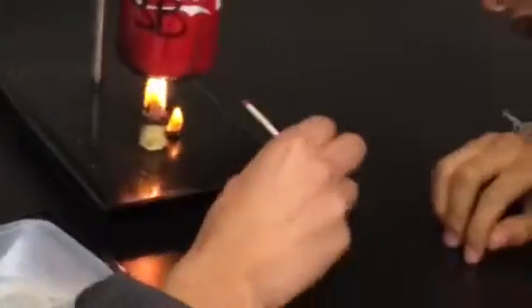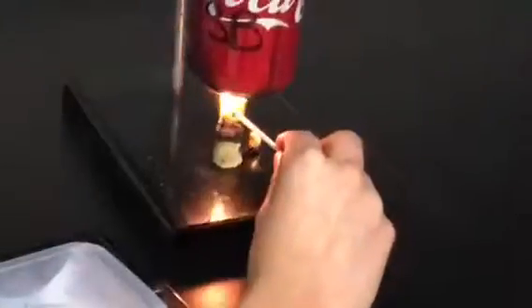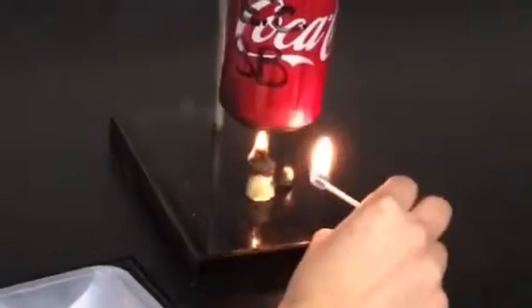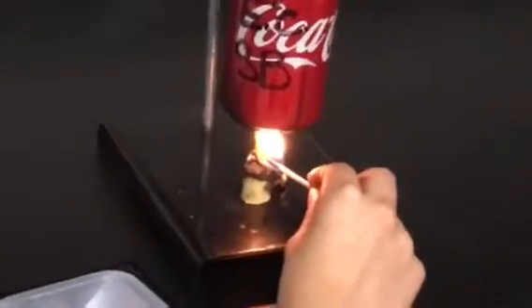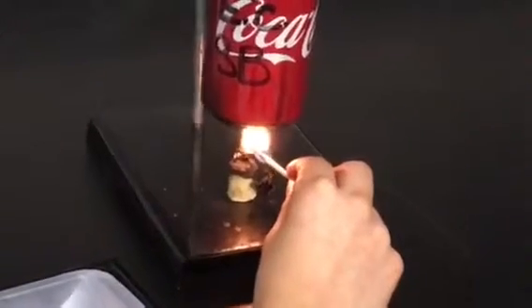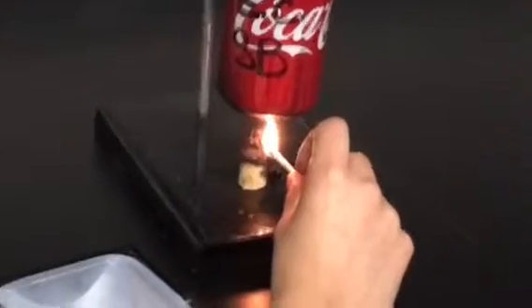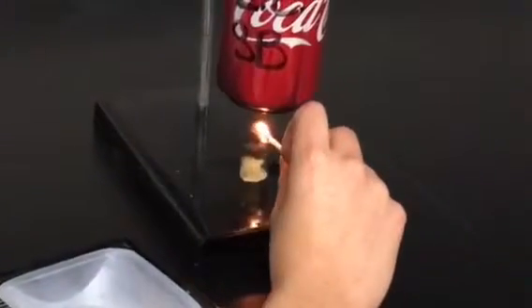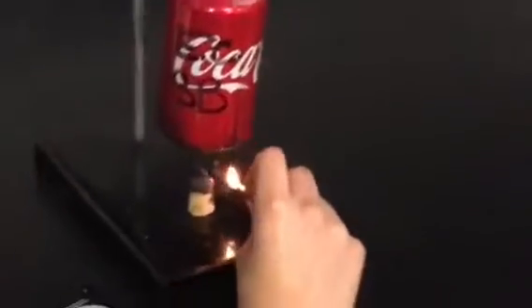Save it, Carlos. Save it. Can you grab another stirring rod from the back? What are you doing? Put it right there. Trying to burn the popcorn, and ended up not burning the popcorn. Wait. We must never be too short, guys. You're just burning the cork now.